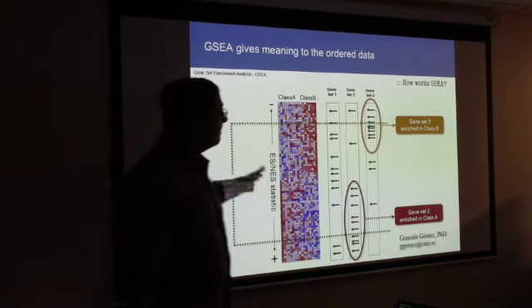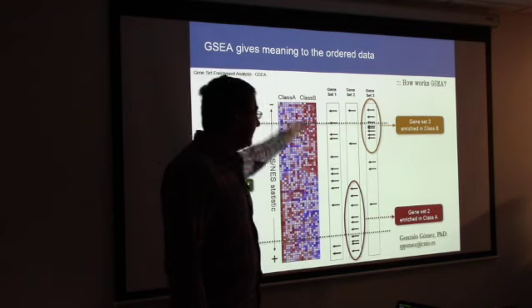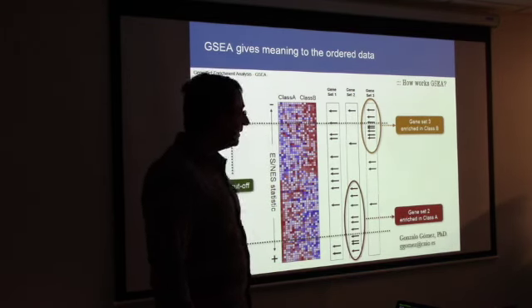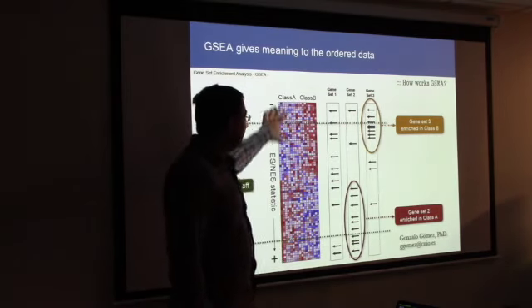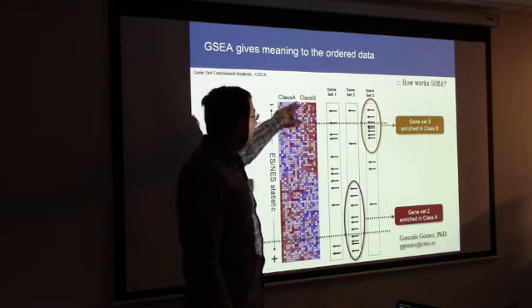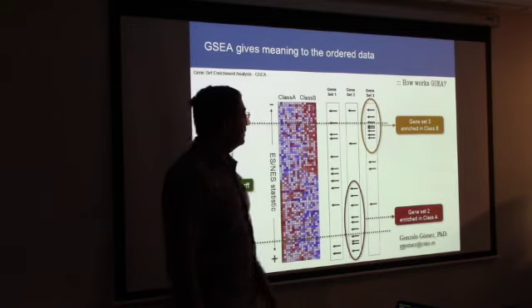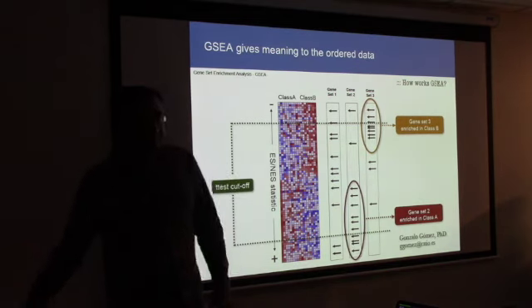And then you line them up in whatever order you choose. You can line them up against your data set. So what does the lining up mean? It means that you look at the genes in your gene set and try to find the location of those genes in this heat map, right? So what are your first few thoughts when you look at this gene set 1? What do you think is going on?